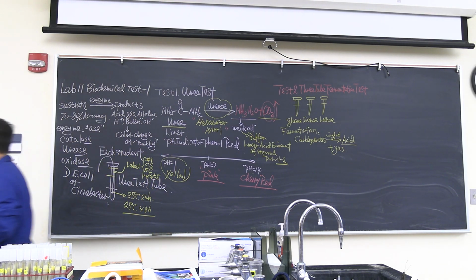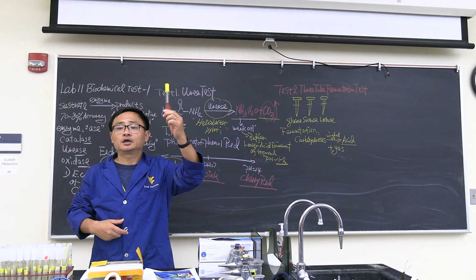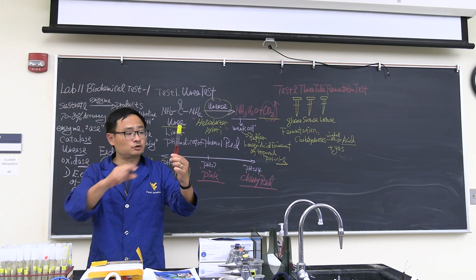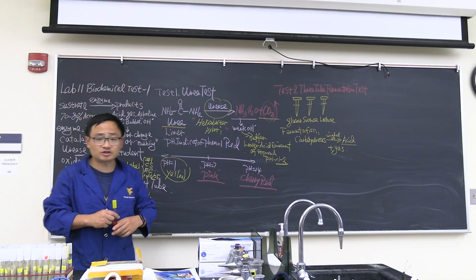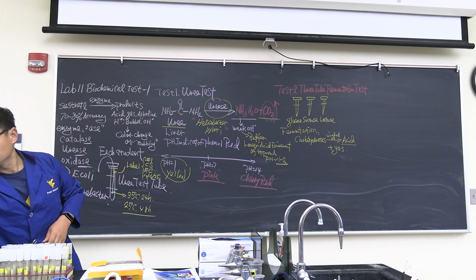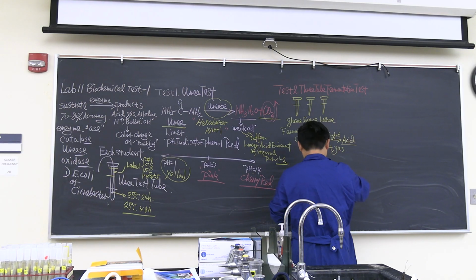So, the 3-tube fermentation test is also very straightforward. Let's say you have a glucose. You inoculate the bacteria, put the bacteria inside. And then we do the incubation, and then you see the yellow color comes out. It's acid comes out. So that means acid comes out.